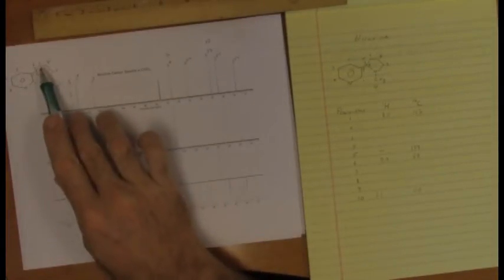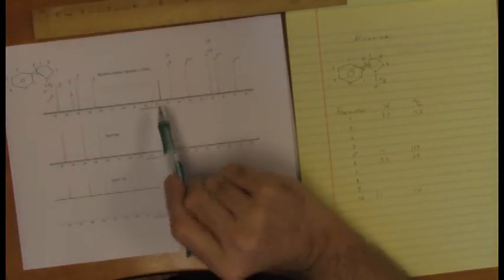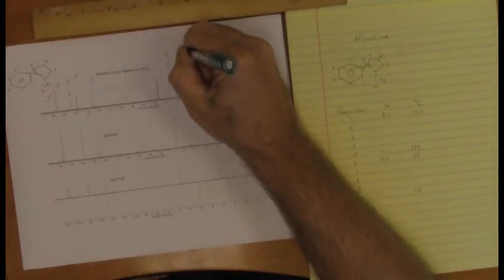One other one that I think is pretty clear, we can make a pretty good case for, is position 9. Of the remaining parts of this molecule, these 3 CH2s, positions 7, 8, and 9, position 9 is the one next to the nitrogen atom, the electronegative nitrogen atom. And so I am going to make the assumption that this is position 9, the most downfield of the 3 CH2s. That's a reasonable assumption to make. That gets me another characterization here, about 57 ppm for the carbon of position 9.